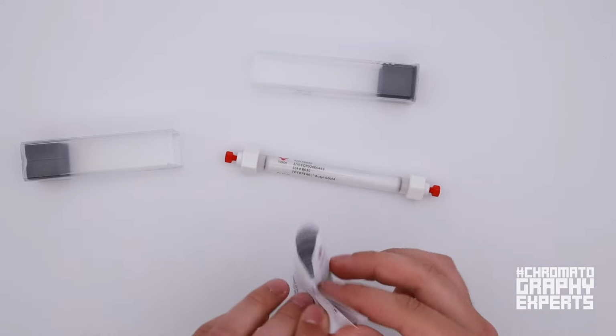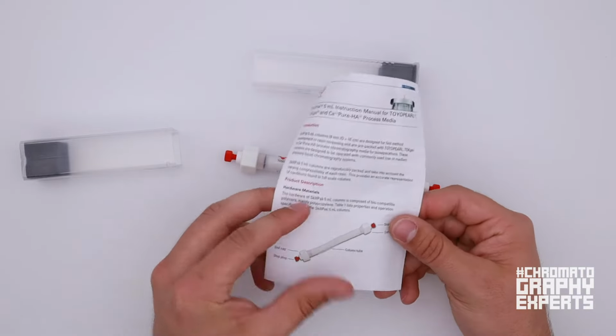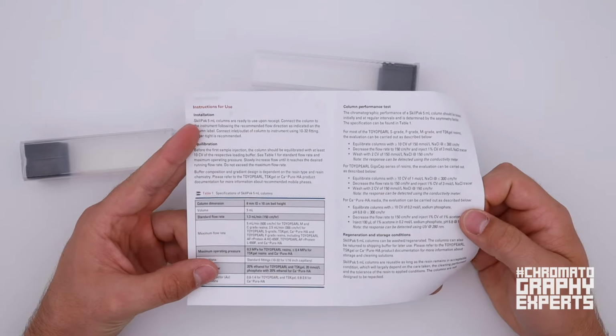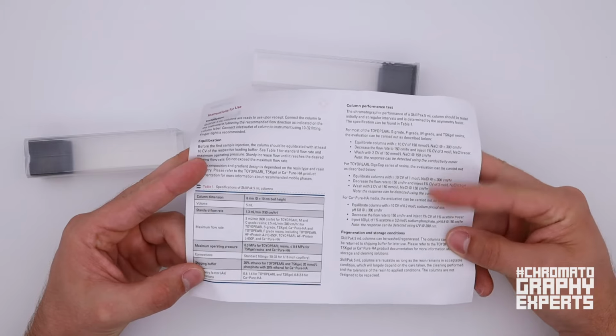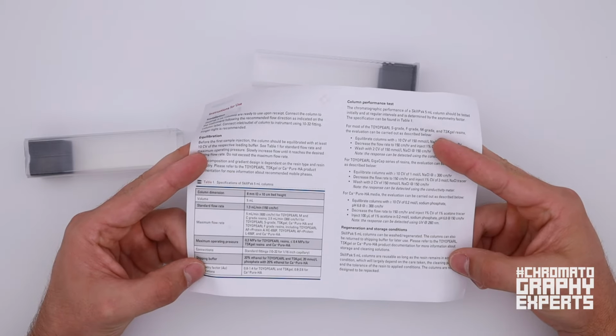and the instruction manual. The instruction manual for the 5 milliliter column contains a bit more information. It also shows you again how to install it, how to equilibrate it, some specifications, and it also tells you how to do a column performance test and the regeneration and storage conditions.